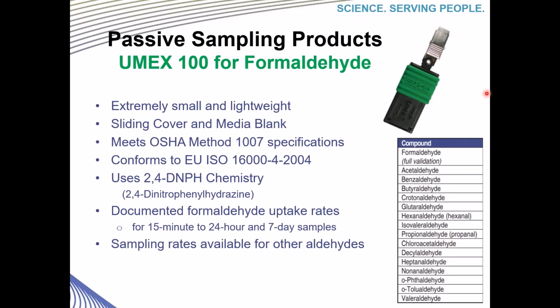And I want to take a second to say that our stance on the blank is that you don't necessarily need to have every blank analyzed for each sampler, but it is provided if necessary. So we recommend that you consult with your lab to be sure that the proper sampling and analysis is being performed for your application and that you are on the same page.